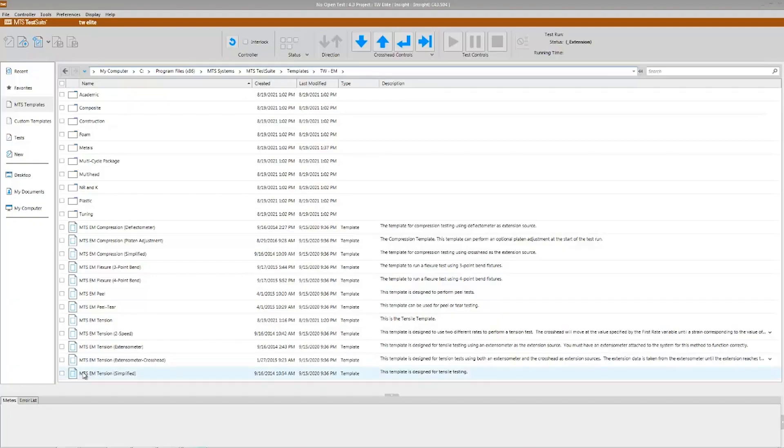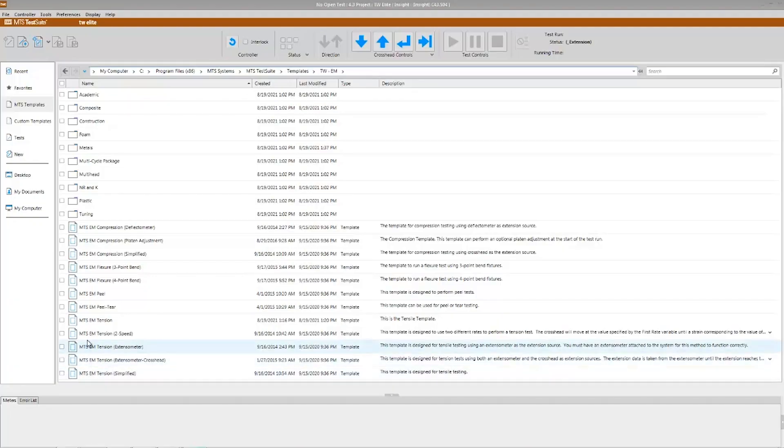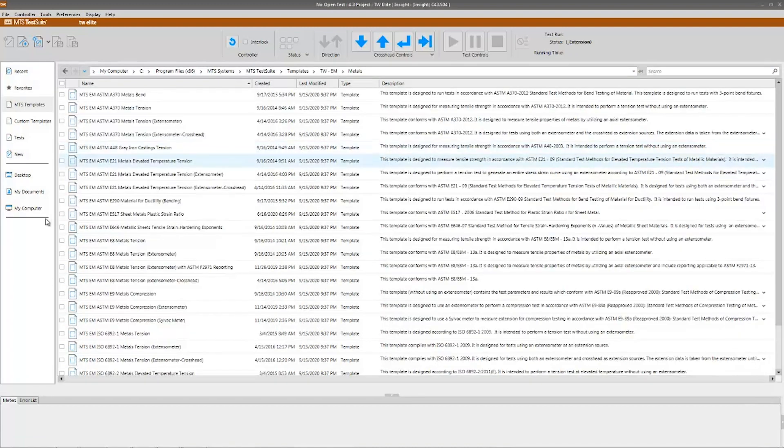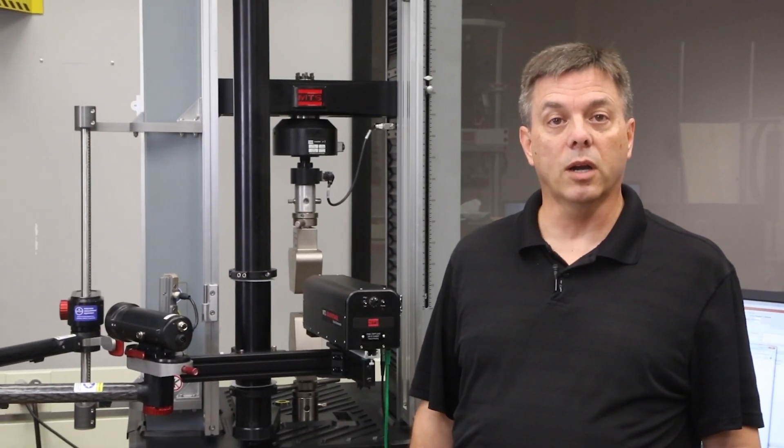The test suite software that runs on these systems is even more configurable. It comes with a set of basic test templates and has optional packages for testing based on global standards like ASTM and ISO. These tests can be run as they are or modified to meet your specimen requirements.